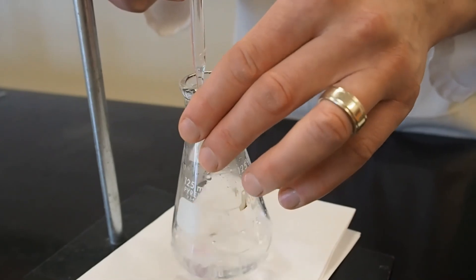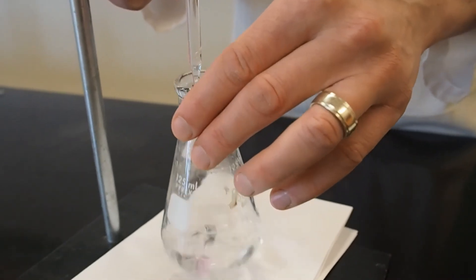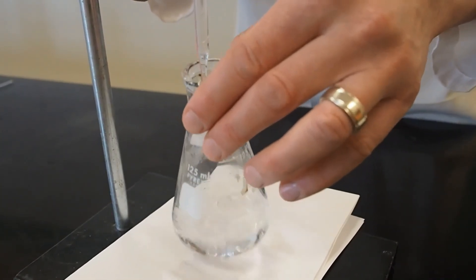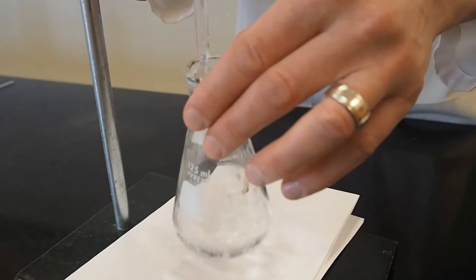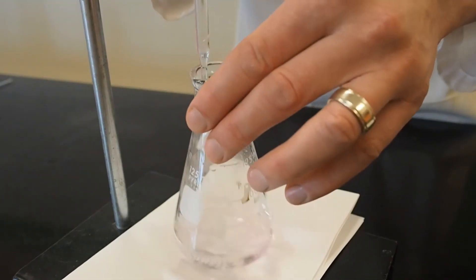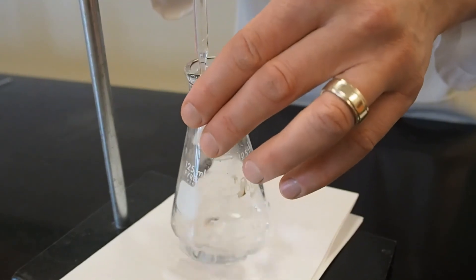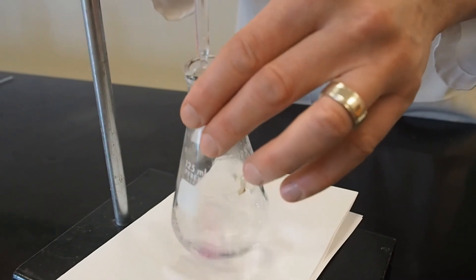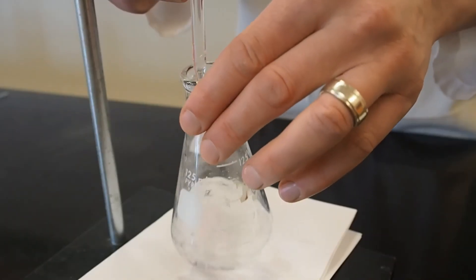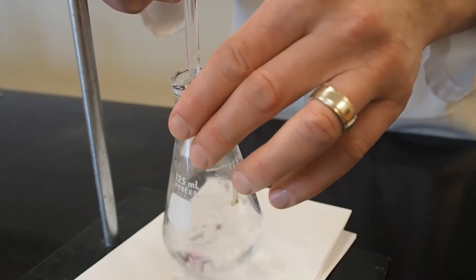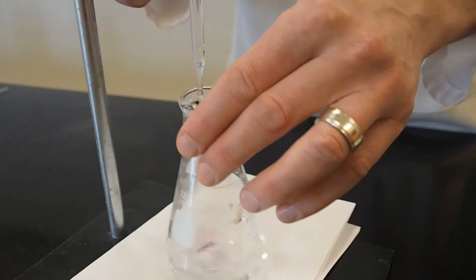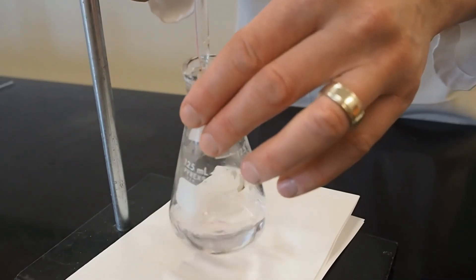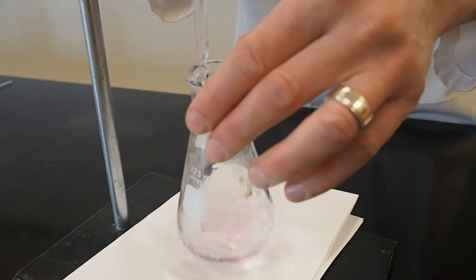For your next trials, you are aiming to get to the precise end point. Do not forget to add indicator or to record the initial volume in the burette. Once you have an estimate from your quick trial, on subsequent trials, you know how much volume is likely needed. So let the titrant run rapidly at first, swirling the flask continuously until you are within a couple of milliliters of your expected end point. At this point, slow the flow until you are adding drops.